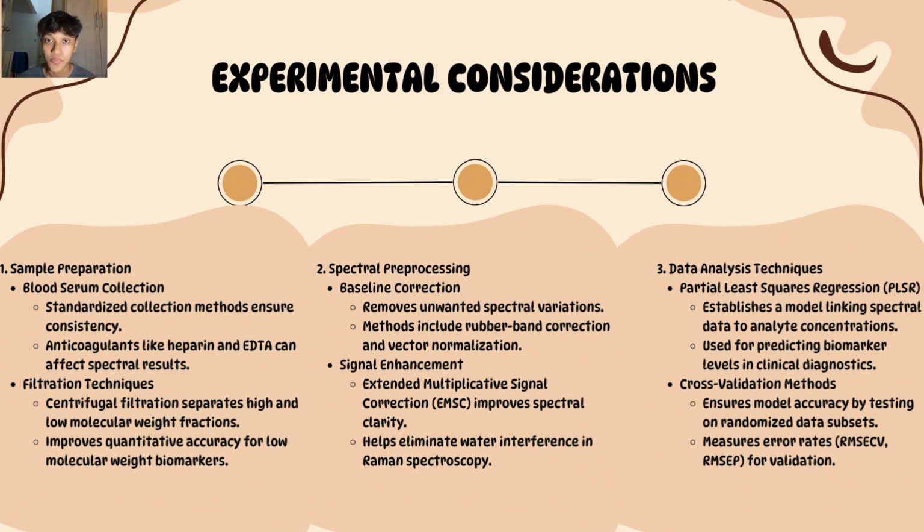In blood serum collection, we will standardize collection methods to ensure consistency. Also, anticoagulants like heparin and EDTA can affect spectral results. For filtration techniques, centrifugal filtration separates high and low molecular weight fractions, and it can improve quantitative accuracy for low molecular weight biomarkers.